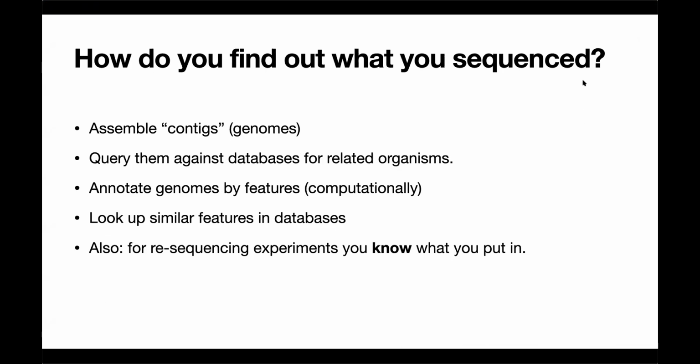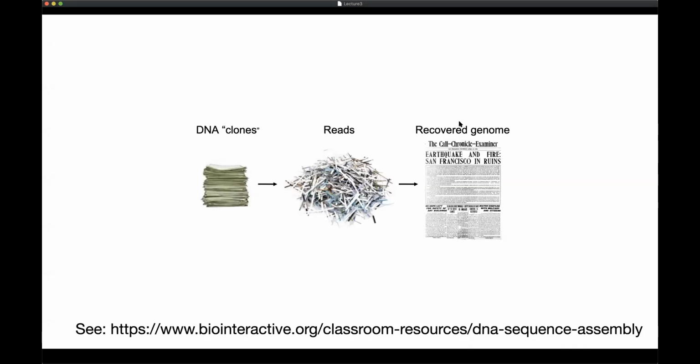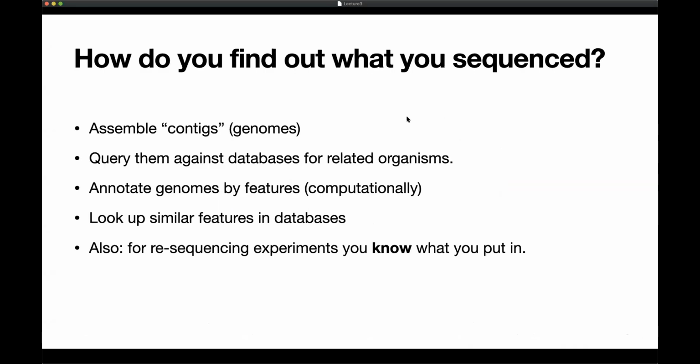All right, so now we've generated a sequence. We've done something to correct errors, perhaps. And we now have a large file with many DNA sequences. So the next question is, how do you find out what you sequenced? Well, there are a couple of steps there.